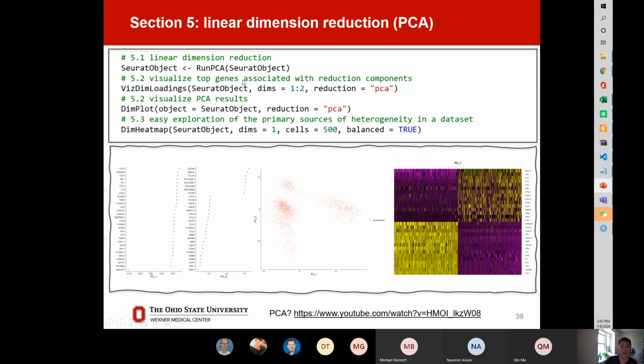If you are a high-level student and you want to explore which gene plays an important role in PC1 and which gene plays an important role in PC2, I recommend you use this command with the loadings. That is, visualize the loading score of PC1 regarding the genes.